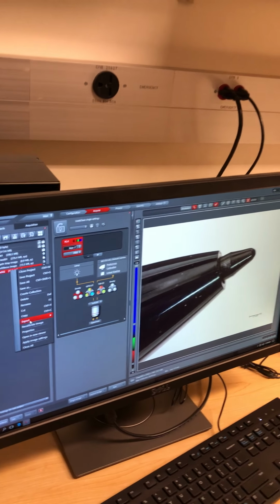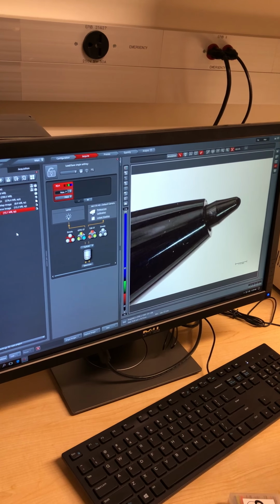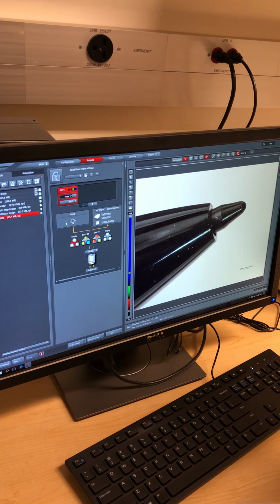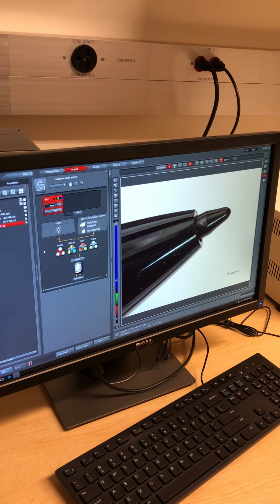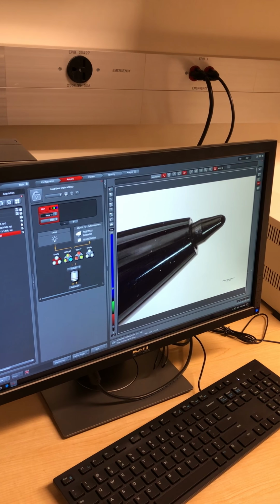Do you want to send it to somebody? Because if I just want to do Photoshop and I don't want to deal with ImageJ or Fiji, let's say. Yeah. And then the scale bar though, how does that work? Can you burn that? The scale bar is burned. You can burn it to the image.